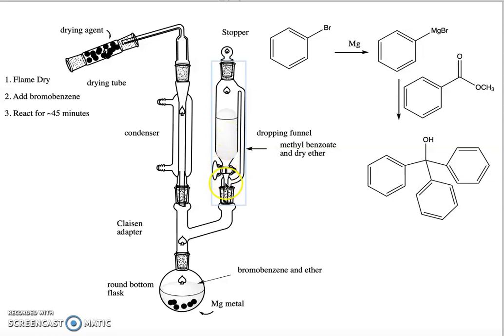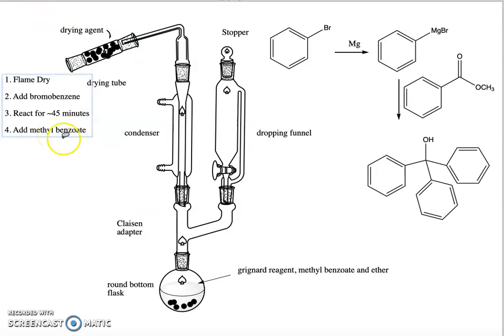Now the methyl benzoate and the ether are in my dropping funnel. I'm going to do as I did before—I'm going to open the stopcock and let it drip slowly into my flask containing my pre-made Grignard reagent.